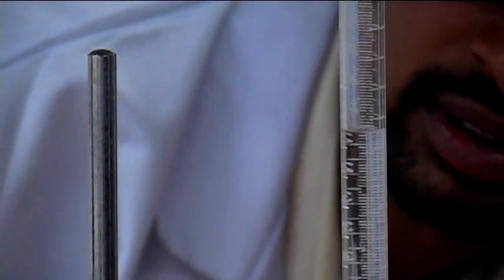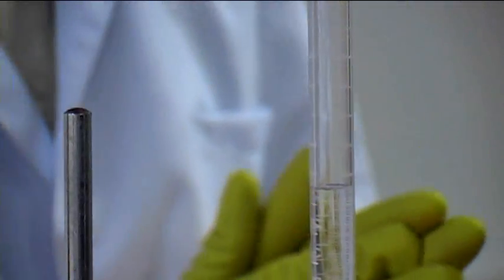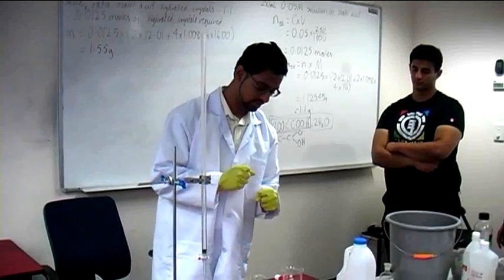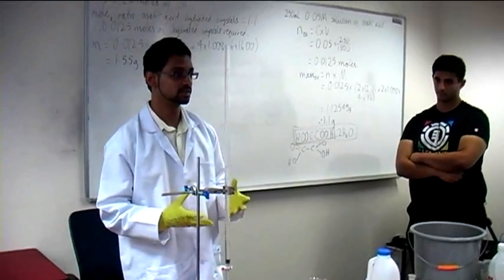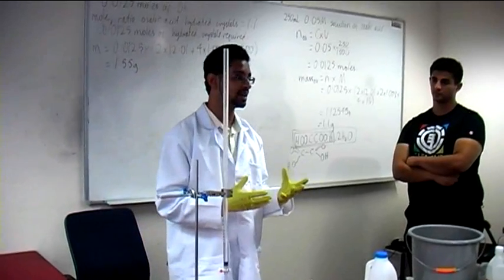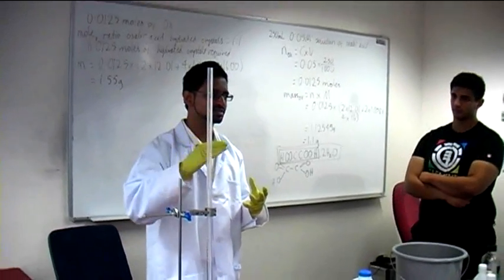So let's get our measurement. We have exactly 16.4 mL on my account. So you're going to record that as your next one. Write that down as your second measurement. We're going to need three of these so that we can then take an average. Now, the reason we take an average is you can see I'm getting progressively more accurate.